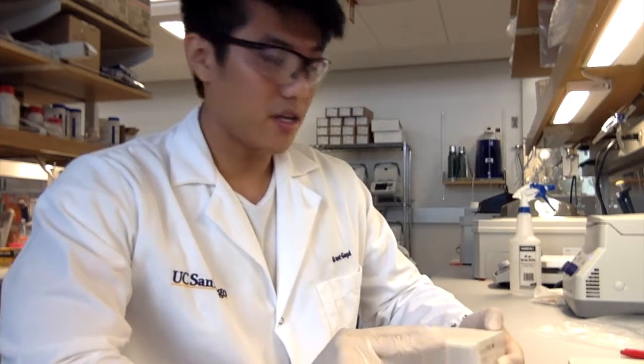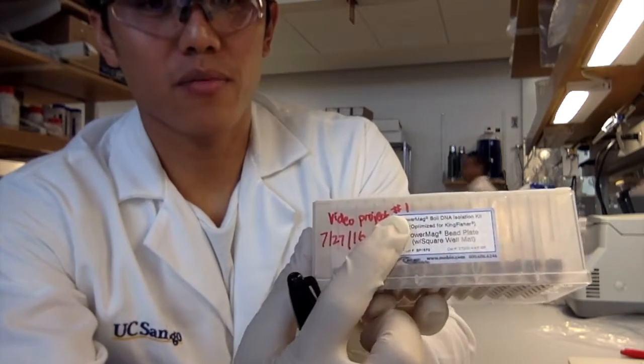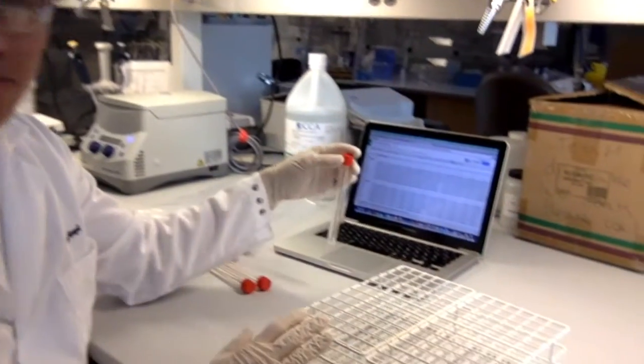Step 5: Using your sharpie, label your plate. You should label the front of the plate so that, while staring at the label, A1 is in the top left corner. You want to label your plate with the project name, the plate number, the date, and your initials. Step 6: Organize your samples on your mapping rack according to your Excel template.